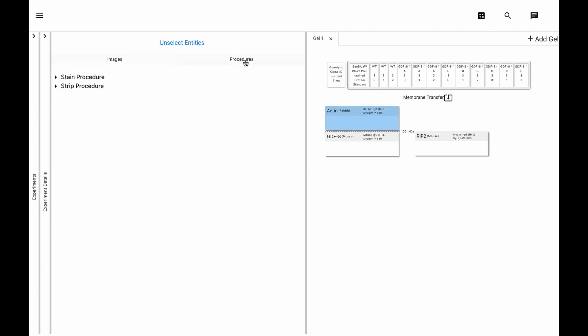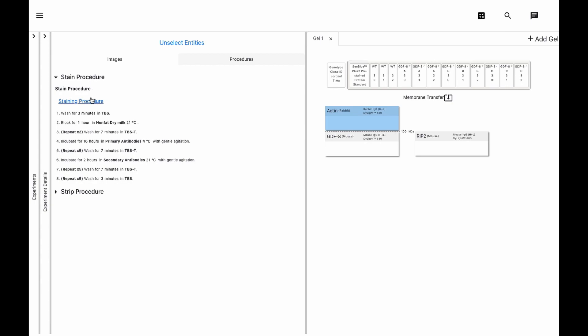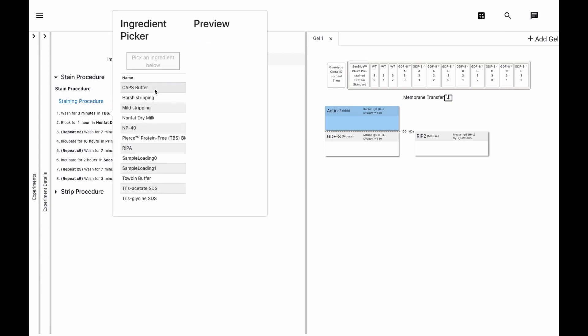We can tweak all the details of the stain procedure on the fly, like our buffers and how long we wash for and at what temperature.